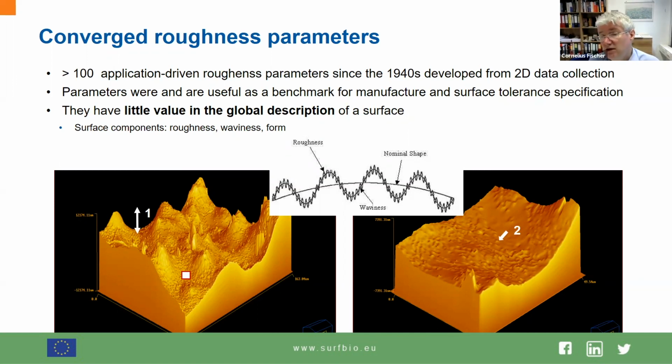So in that sense, if you want to talk about roughness and surface shape and surface variability, it's about the wavelength of aberrations. This is something we have to keep in mind, how the concept has been introduced. It comes from material science, production of material, steel material. There is friction of steel material. It has been applied to some mechanical treatment, and then people want to compare what has been changed. So that's the basic motivation of a surface roughness parameter.